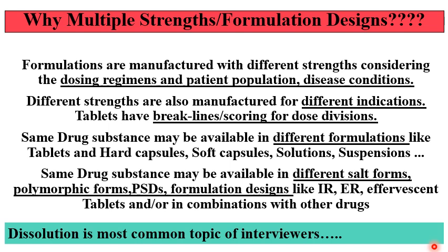Also, some drugs are available for different routes of administration, but in this session, we will consider only the oral route and why the specific dissolution testing conditions are required for each of the formulations and why each product has specific dissolution conditions.